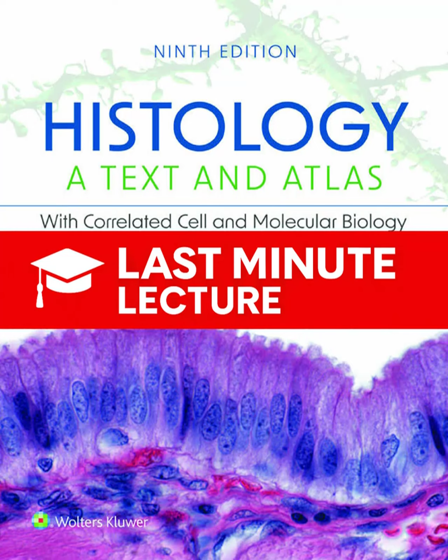And the second, faster method is flow cytometry. Right. Flow cytometry is for cells that are suspended in a liquid. Instruments scan thousands of individual cells, one by one, very rapidly. And this technique usually measures fluorescent light coming off a specific dye that binds to DNA, rather than measuring absorption from the Feulgen stain. So why does a pathologist care so much about the ploidy pattern? What's the big clinical insight here?